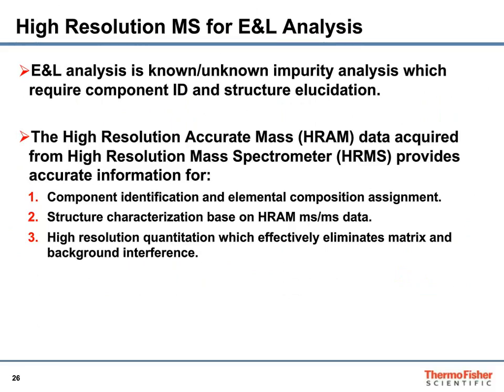I would like to particularly talk about the high resolution mass spec for E&L analysis. As I just mentioned, E&L analysis essentially is a known and unknown impurity analysis. So impurity analysis requires component ID and structure elucidation.